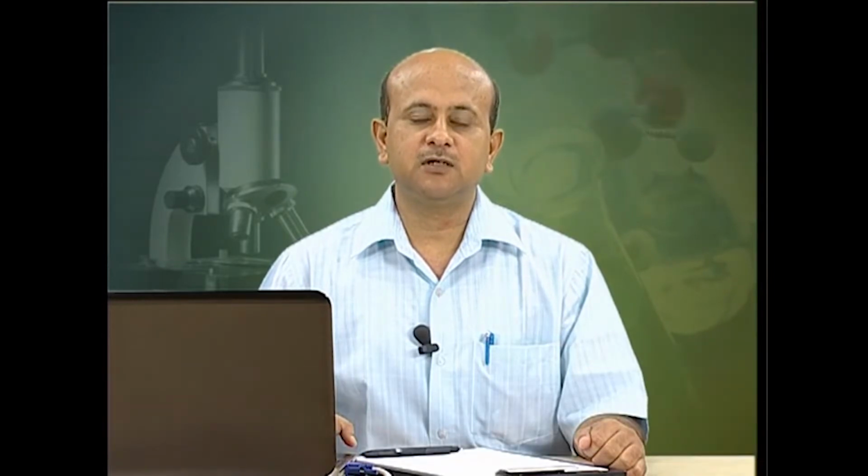Now, infrared spectroscopy, which falls under absorption spectroscopy, takes into account the transitions that happen between the vibrational levels in the ground state.